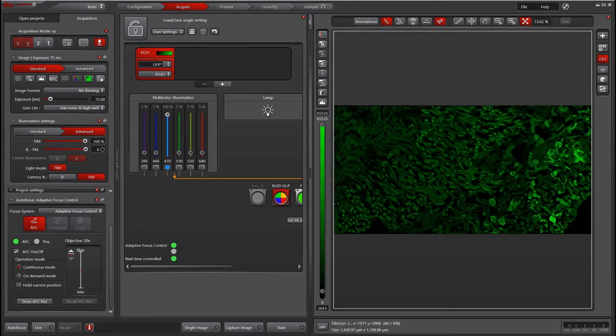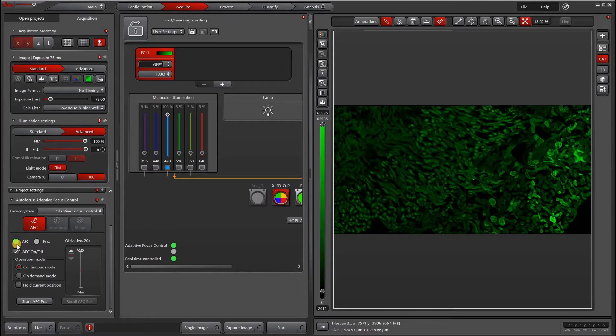These are great samples to use with AFC. You may experience less stable performance when trying to use AFC with an oil immersion lens and a fixed sample because there's less difference in refractive index.